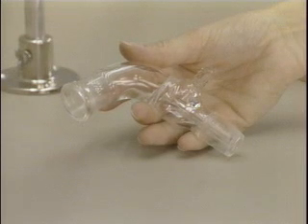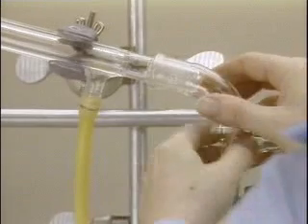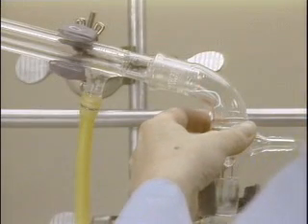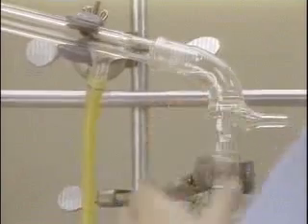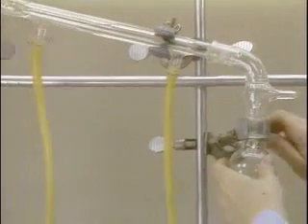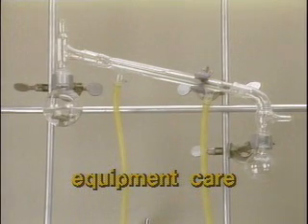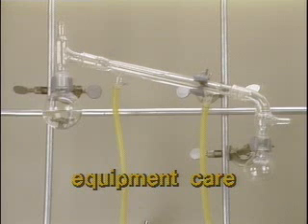An adapter is used to lead the condensed material to a collection vessel. This adapter is also loosely clamped during the initial setup of the apparatus. All the equipment must be secured tightly before the distillation. However, it must be aligned first to prevent stress on the joints, which may result in leaks or broken apparatus.